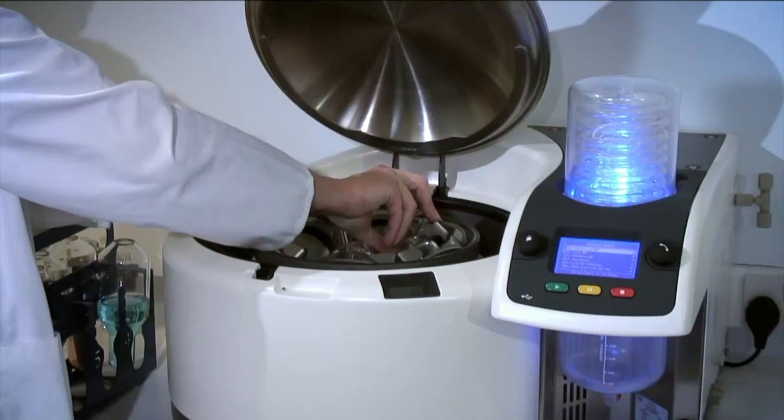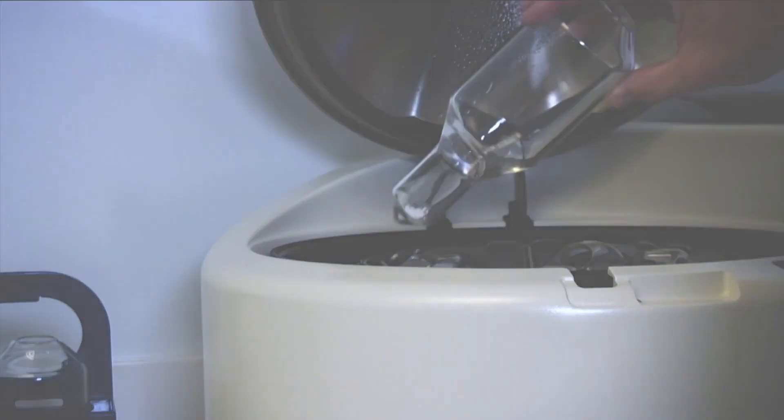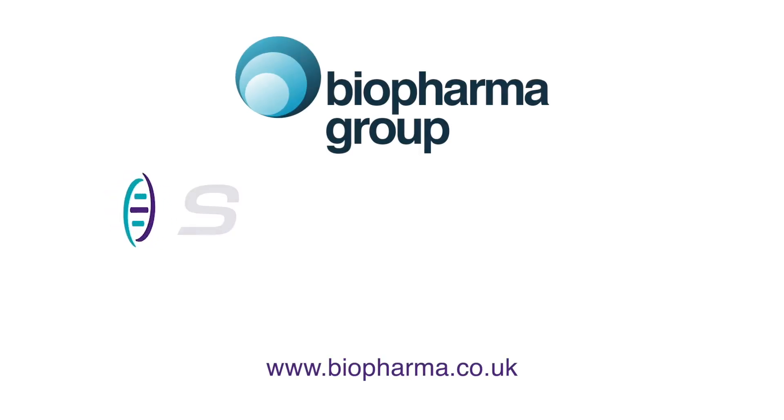When the system stops, open the lids and remove your samples. For more information on the rocket synergy, contact GENEVAC today.